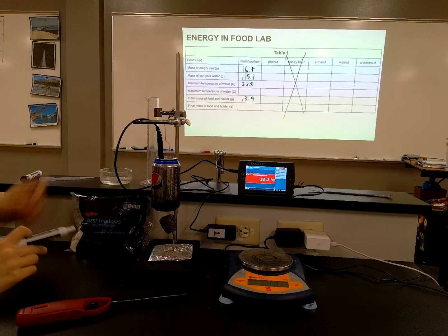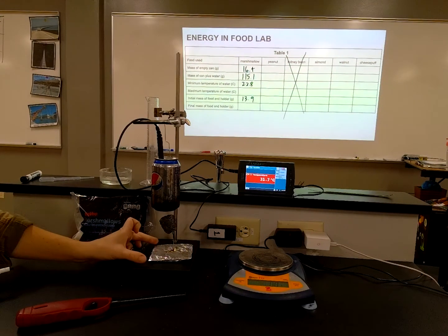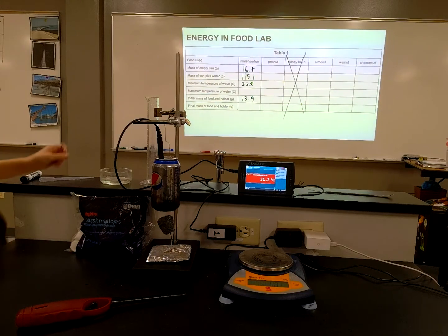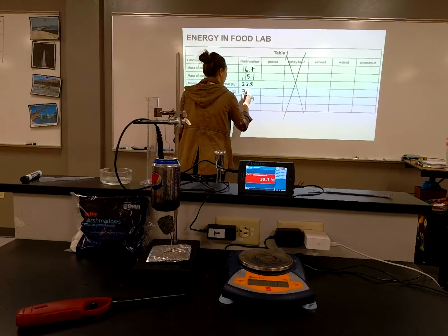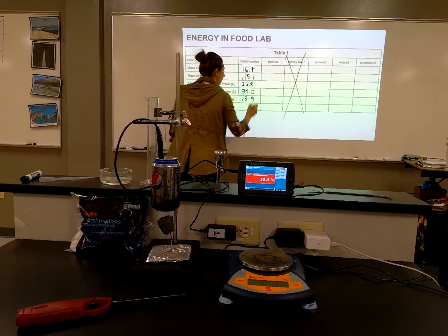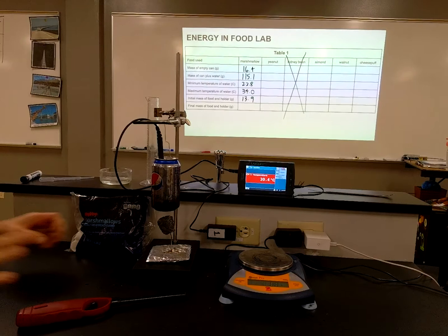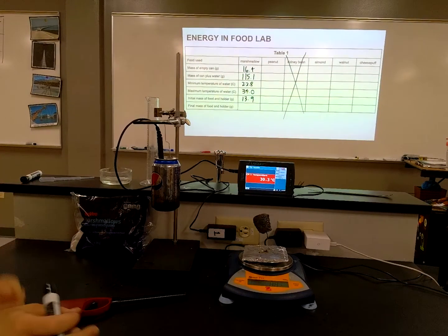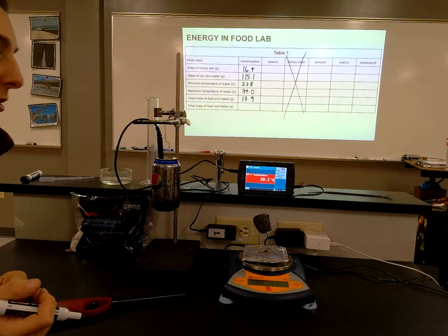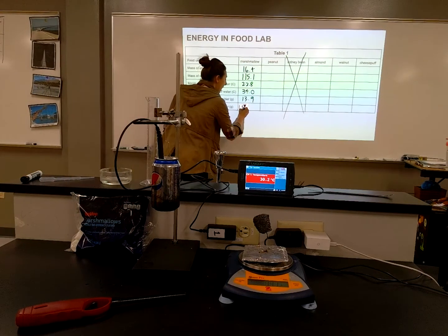Okay, so the maximum temperature I think I saw was 34 degrees Celsius. And the final mass, 13.1 grams.